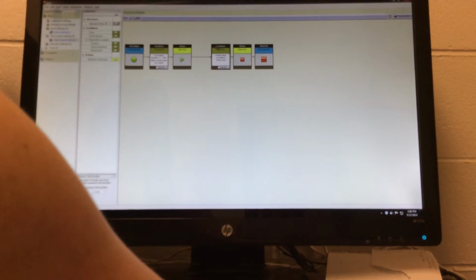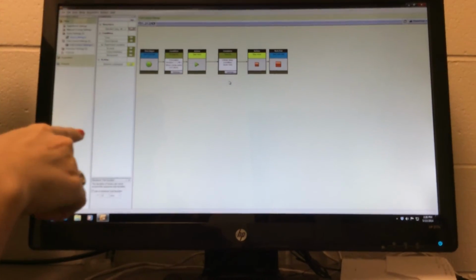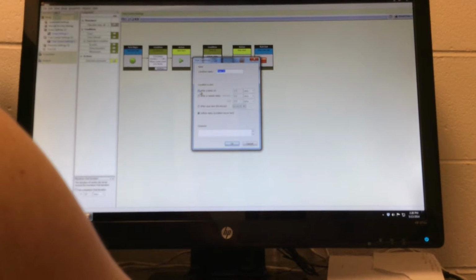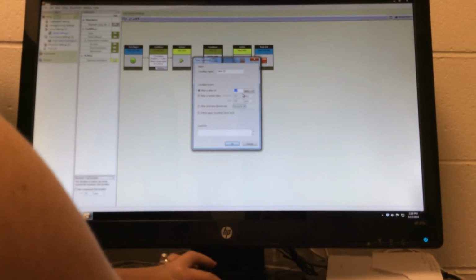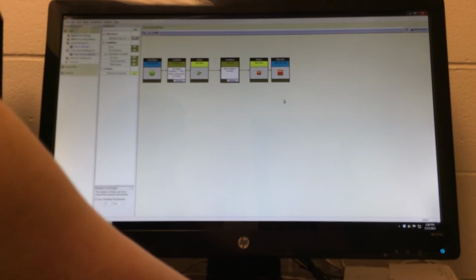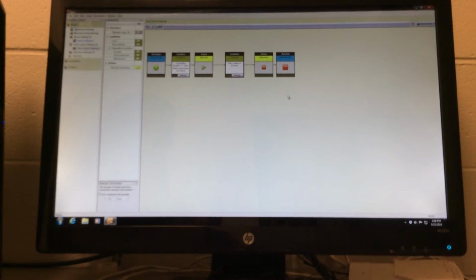Then you have to tell it when to stop. So the infinite delay basically means it's just going to keep tracking until you hit the stop button manually. So if you know that your experiments are always going to be 5 minutes, we say after a delay of 5 minutes, stop the track, stop the trial. So it'll automatically shut off after 5 minutes. And it'll wait for you to do the next one. So that's a nice way to do it.